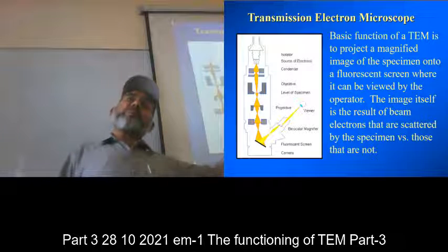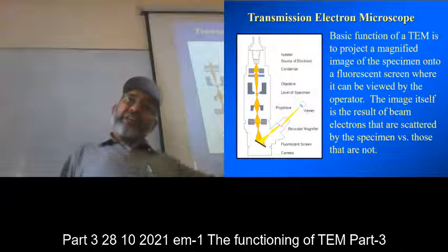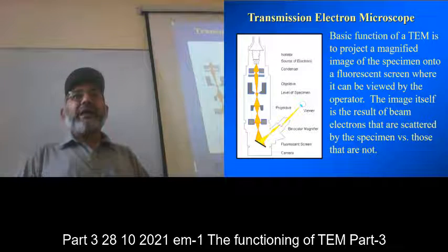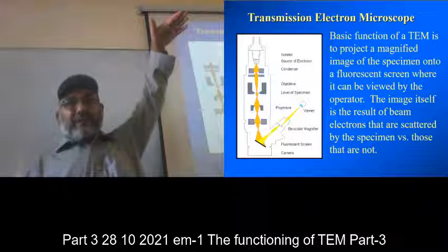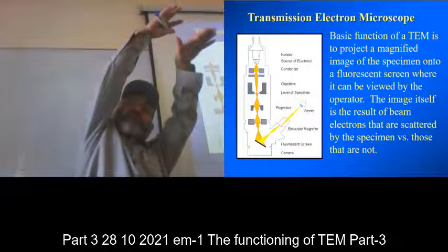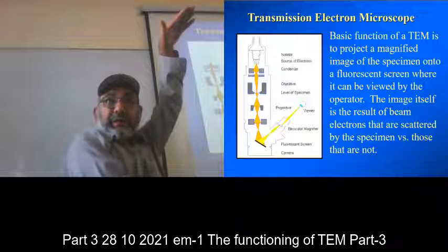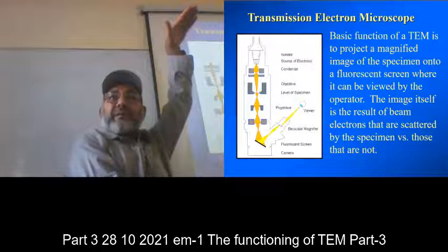Then we used to put it in the drying cupboard overnight, and when it was dried, then we used to take it to the photographic room, and in the photographic room we used to put the film here, fixed in that photography. The light was switched on the top and the film was visible down here. And here we used to put the photographic paper, right?